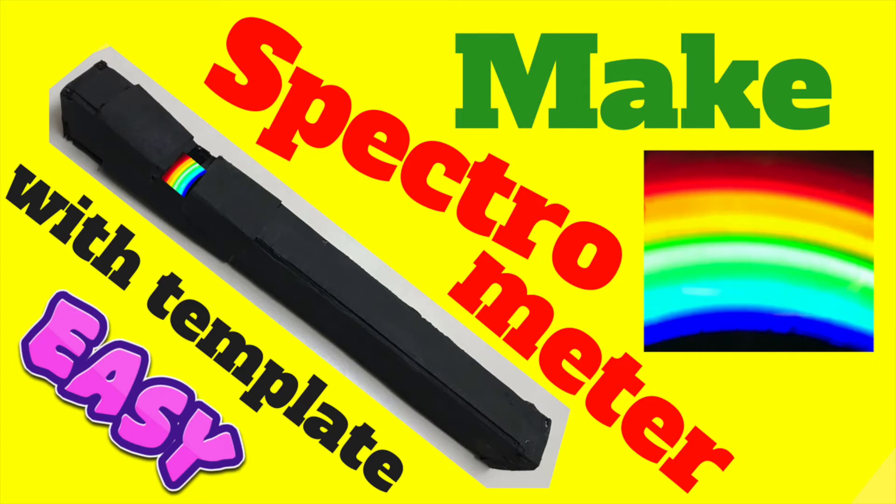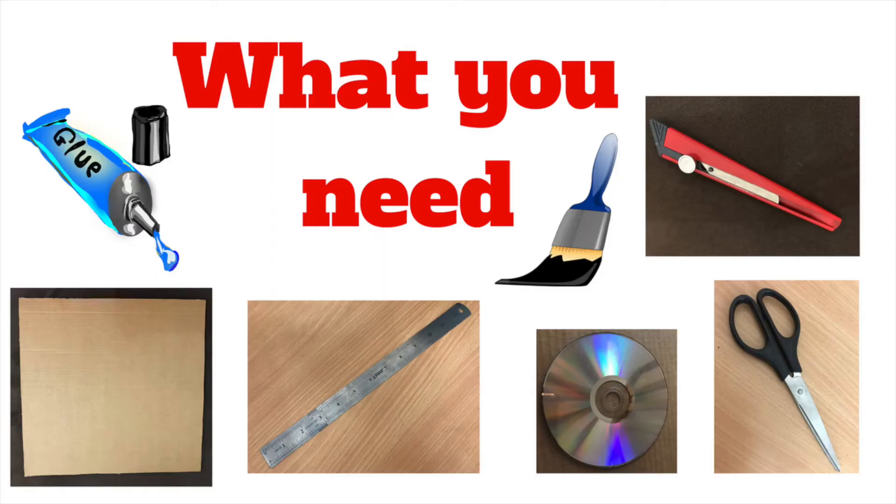Hello everyone! Today we are making a spectrometer. You need glue, a paintbrush, a CD, a scissor, a ruler, a cardboard and a cutter.